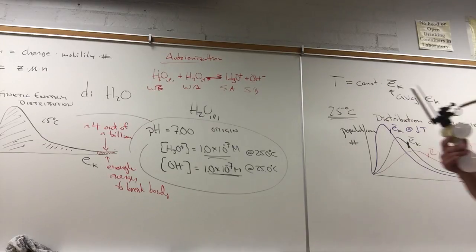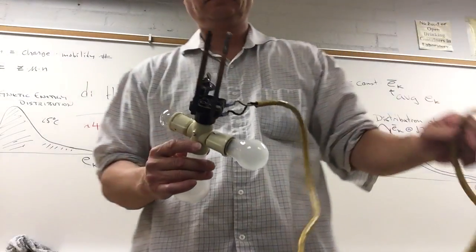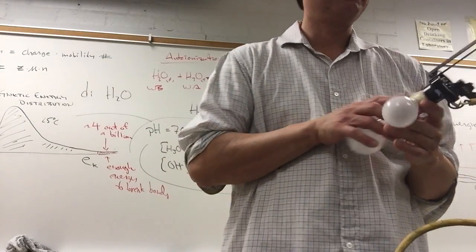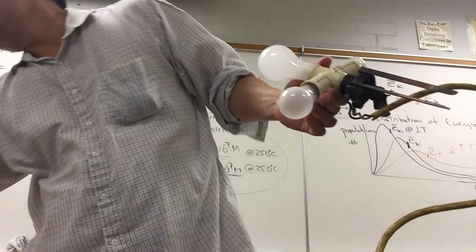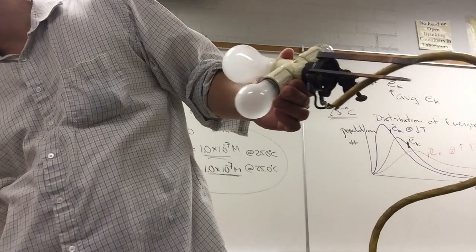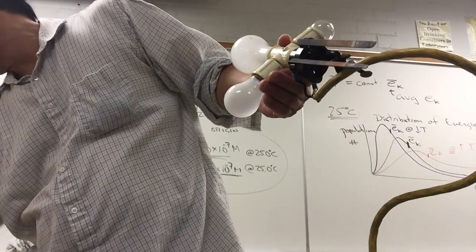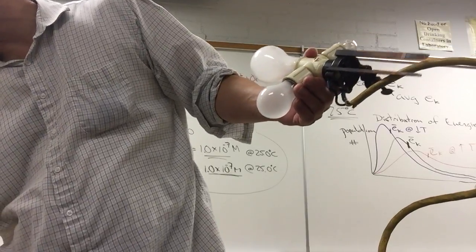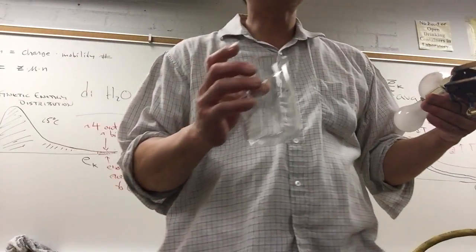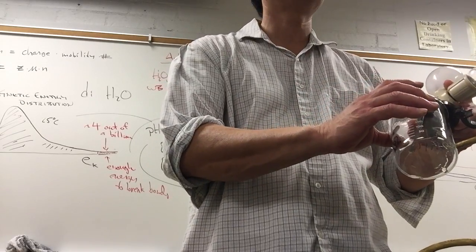The electrodes are very dirty. Will it conduct electricity? It should. If there are ions present, it should, shouldn't it, conduct electricity?